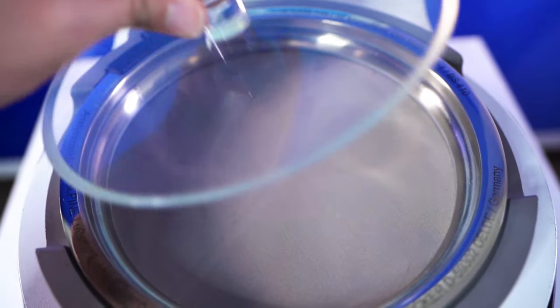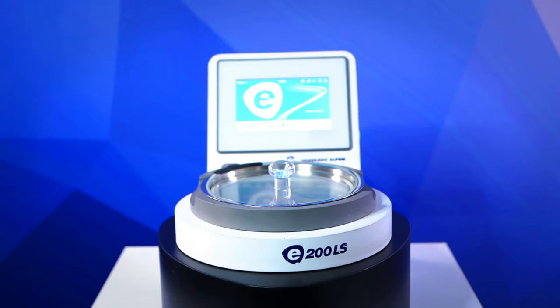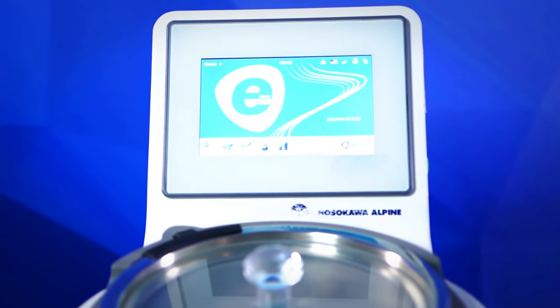The Airjet Sieve E200 LS has specialized sieves with pre-programmed RFID chip technology. The RFID stores the mesh size, number of uses, and serial number. They are 200 millimeters in diameter, with an overall height of one inch and a depth to the cloth of seven-eighths of an inch. Stainless steel sieves range from 20 micron down to 4,000 micron. The RFID technology eliminates potential contamination and saves having to manually input the sieve mesh size every time. You can also use a standard eight-inch test sieve without an RFID chip if you purchase the compatibility adapter.